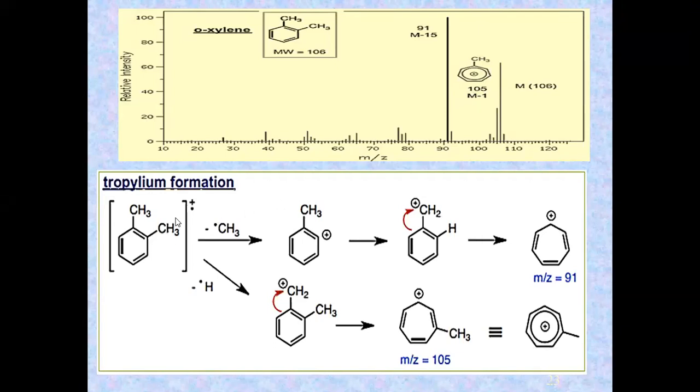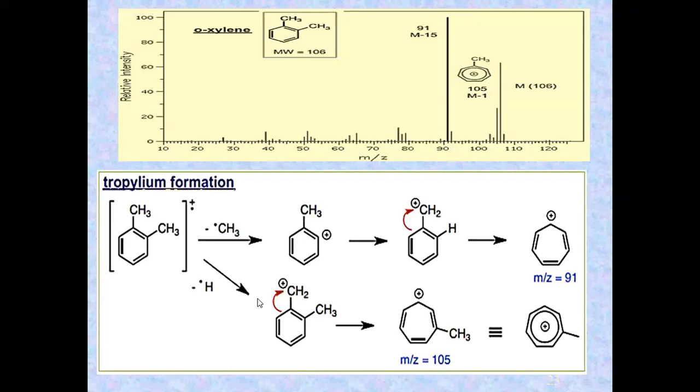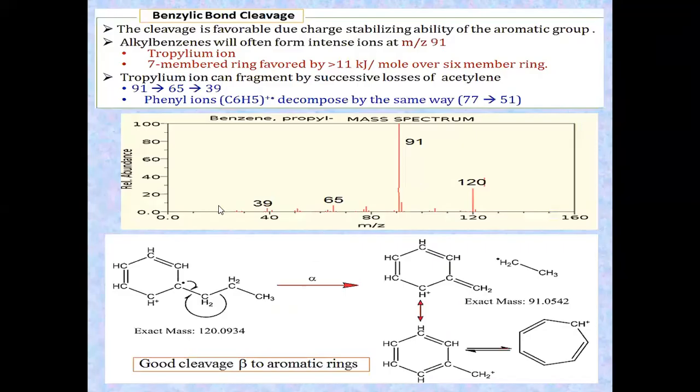So in case I have a substituted tropylium ion, I can carry out the fragmentation in two ways. Either I remove the substituted group and have the tropylium ion, which undergoes further degradation, as I explained here, by losing the first 26 and another 26. Or the substituent remains, and I have a substituted tropylium ion, which gives a substituted 5-member ring after losing 26, and this substituted 5-member ring, after losing another acetylenic group, results in a substituted 3-member ring.